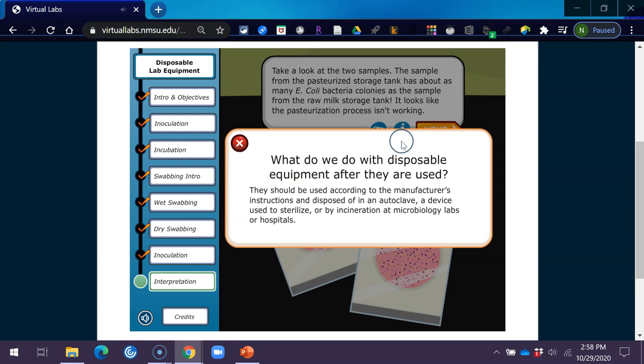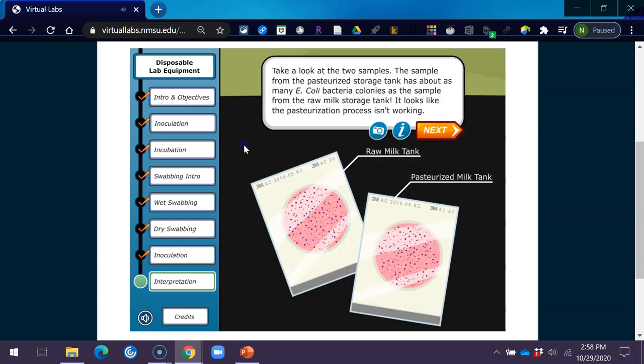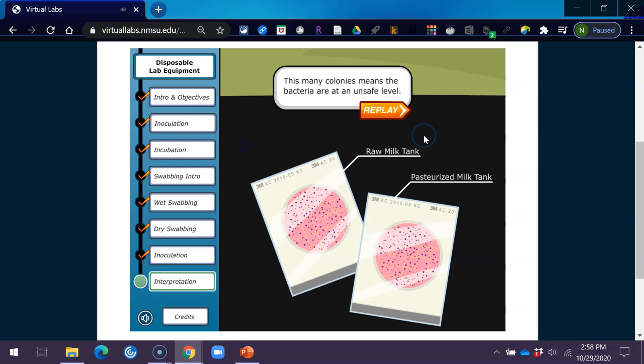Disposable equipment should be used according to the manufacturer's instructions and disposed of in an autoclave — a device used to sterilize — or by incineration at microbiology labs or hospitals. This many colonies means the bacteria are at an unsafe level.